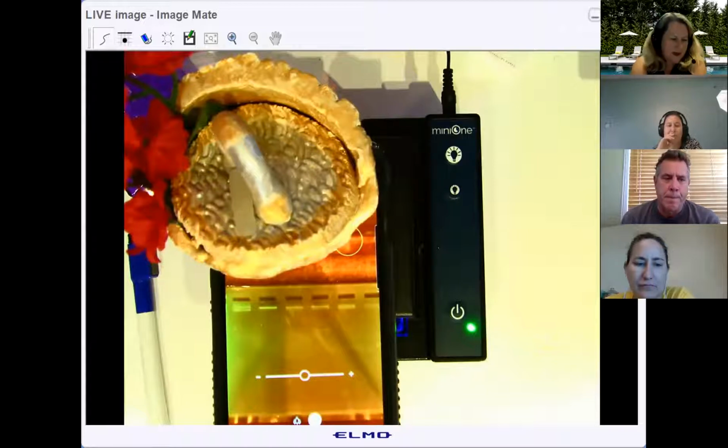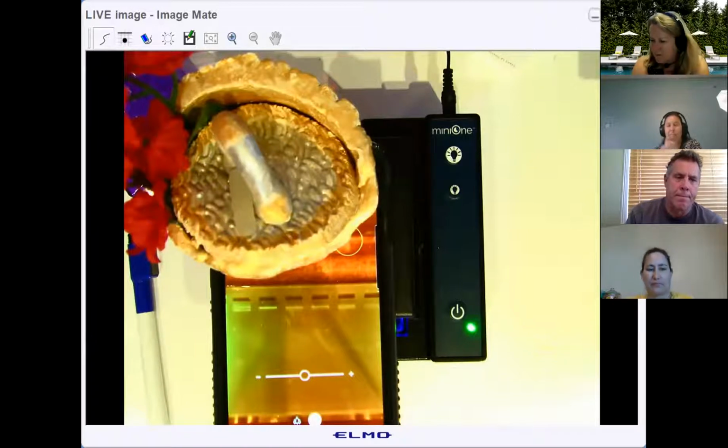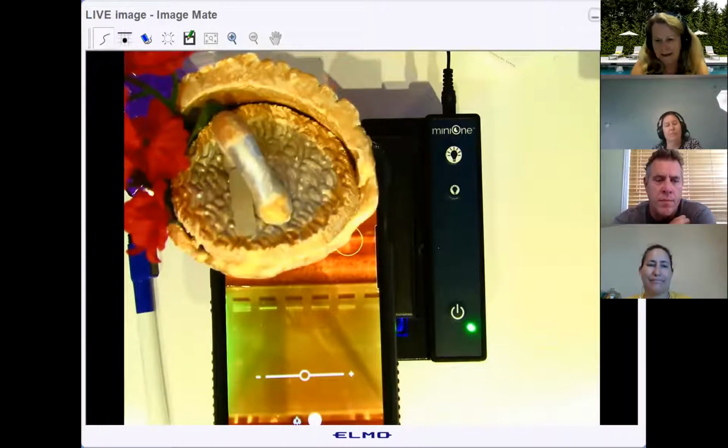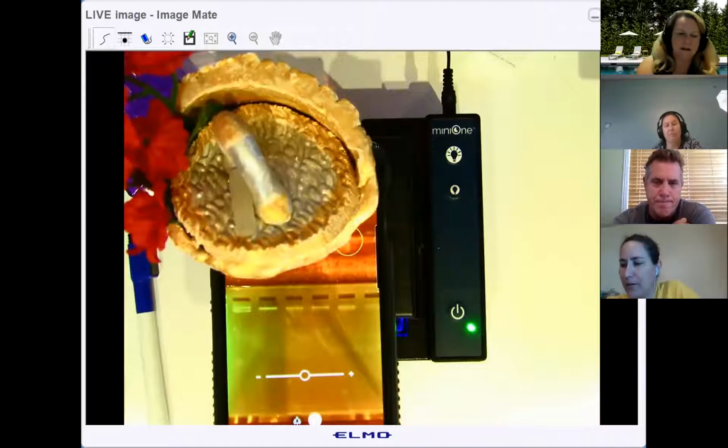Yeah, thank you. And it's eco-safe. I used the BioRad stuff with Fast Blast for years, and I could get it to work, but I would always have to stain the gels overnight, which was kind of a pain because they have two different protocols for using the Fast Blast stain. One of them says you can stain it in 20 minutes. I never got that to work well, never. So I would always have to stain it overnight. So that would take up another day.